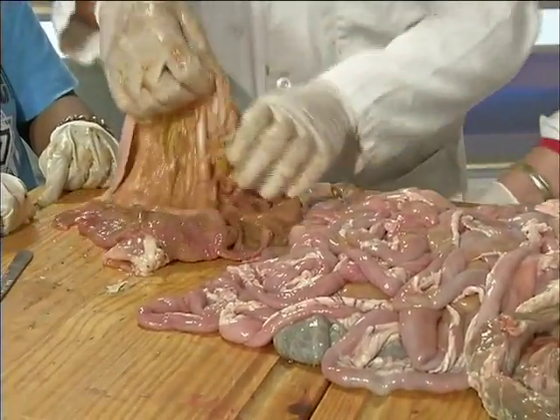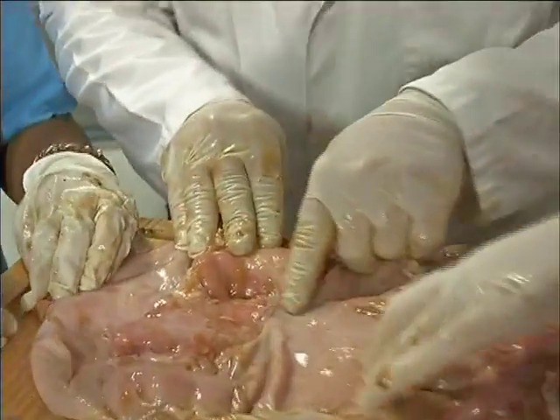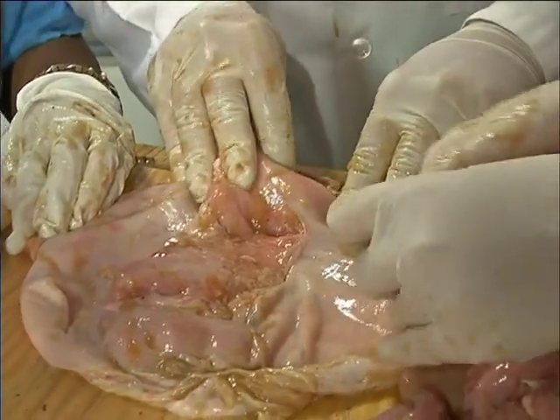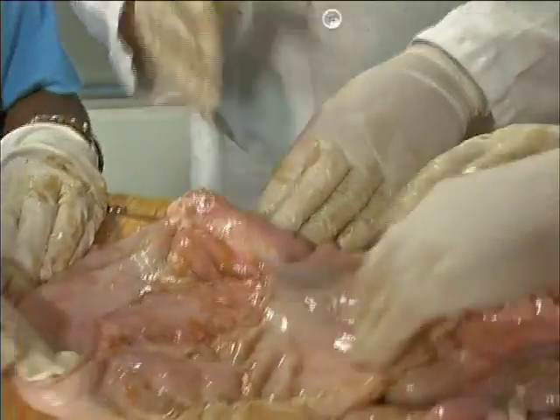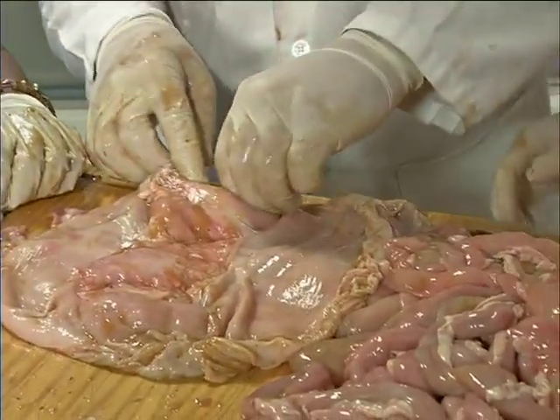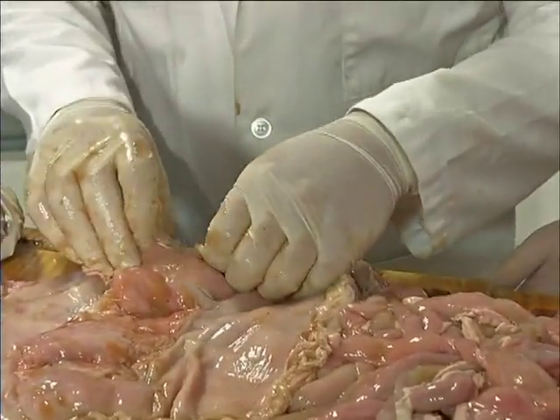I hope you liked that. I think that was a lot of fun. Very cool, look at the blood vessels in there, because remember that there's muscles. This is a big muscle. Right. And on the outside of this is fat. Yes. That's so all the organs have got fat around them. Exactly. And they've actually got this special layer that we cut off, right? There's the fat. We've got this special layer.